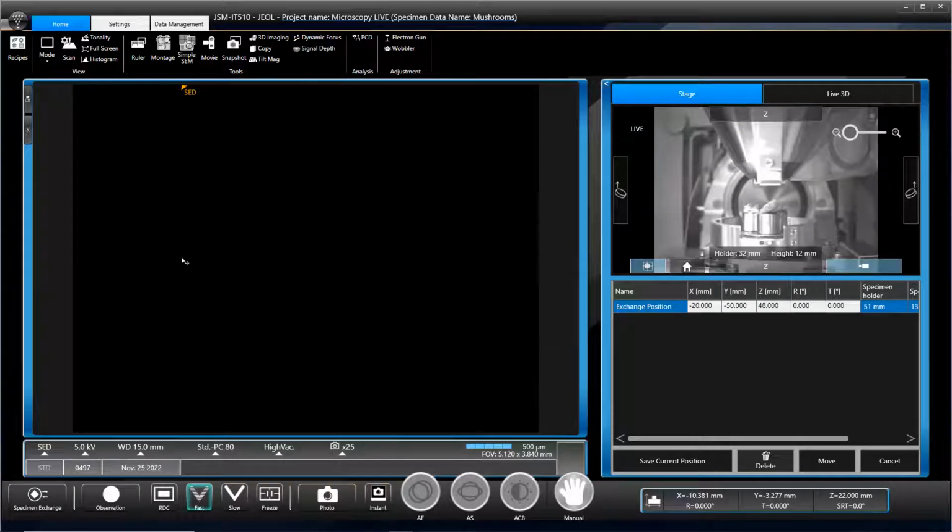So this is our user interface. All the typical buttons that you see, and this is a little live infrared camera inside the SEM chamber, so you can see our little samples here. It's 3 mushrooms that we've freeze dried. The rest of them will be my dinner later on today.